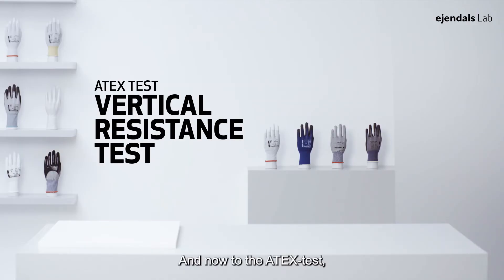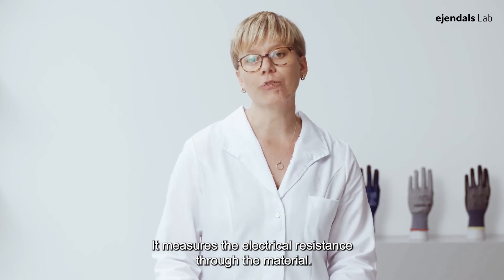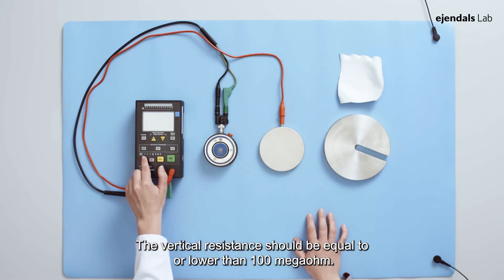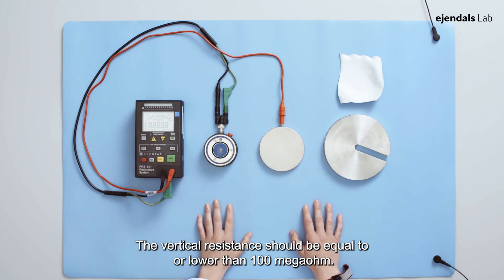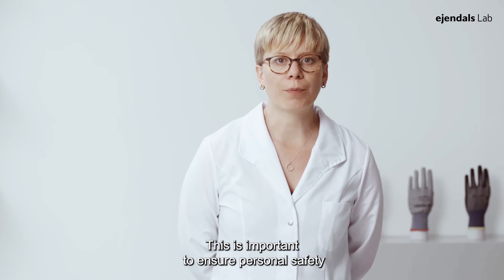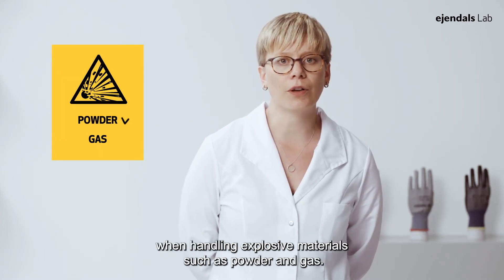And now to the ATEX test. The method is called the vertical resistance test. It measures the electrical resistance through the material. The vertical resistance should be equal to or lower than 100 Mega Ohm. This is important to ensure personal safety when handling explosive materials such as powder and gas.